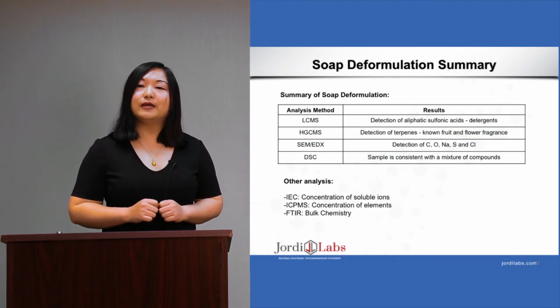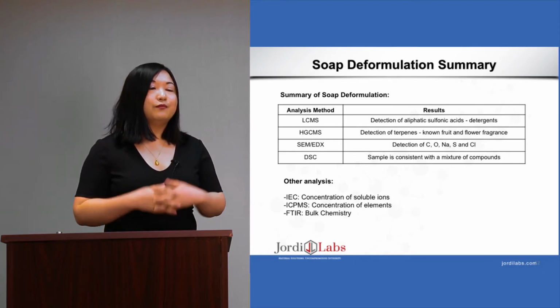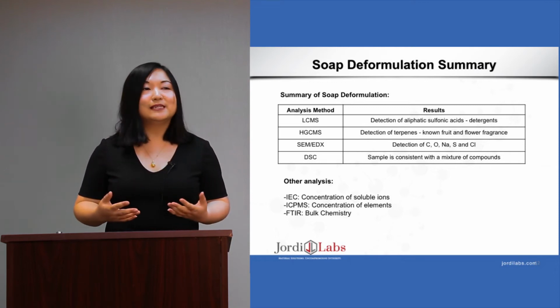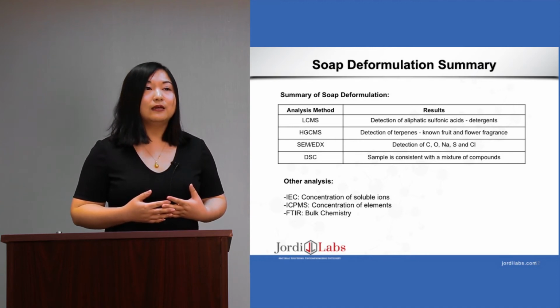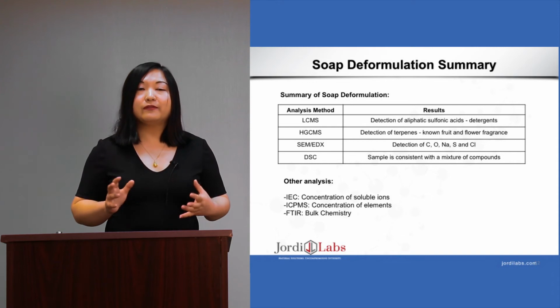So, a brief summary of the deformulation of the bar soap. We used different techniques including LC-MS, GC-MS, SEM-EDX, and DSC to tackle different types of compounds.